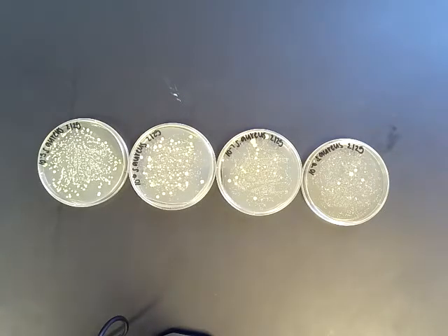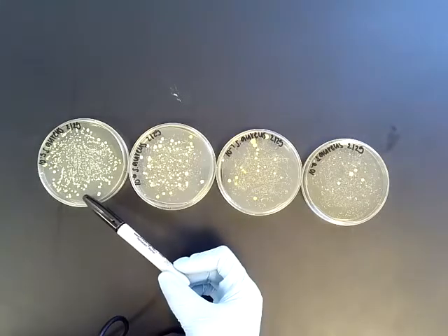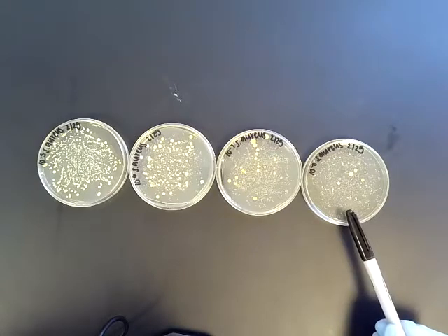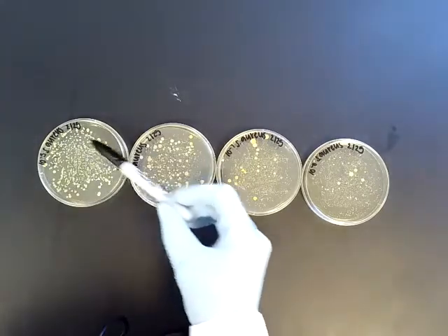A cell that's dead can't grow, obviously. So we can differentiate the dead from the living cells in a culture just by counting the number of colonies that grew. So when you look at these plates here, you can see the dilution has occurred and we've already grown these up. So here's a 10 to the negative 5, 10 to the negative 6, negative 7, and negative 8. And you do see some contamination in the background, but we want to focus on the larger white colonies.